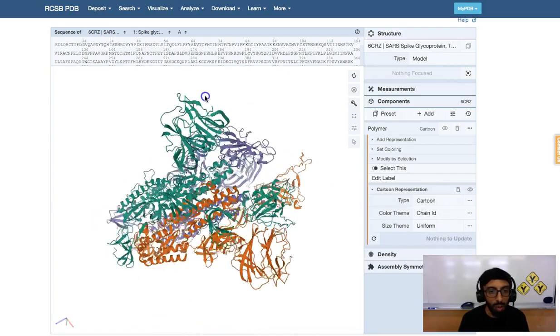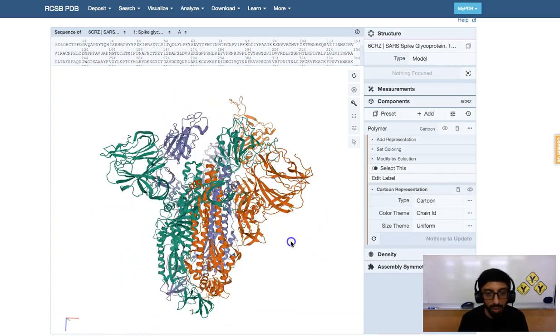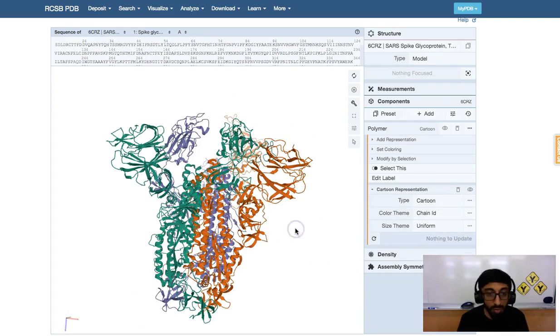Now, the last requirement in this project is going to be to highlight the actual specific examples of bonds that you can find in here. So I would like you to find a hydrogen bond that is part of secondary structure. I'd like you to find, say, a hydrogen bond or an ionic bond or a disulfide bond in tertiary or quaternary structure. So I'm looking for examples of each. All right, so I want you to really look at examples of each.